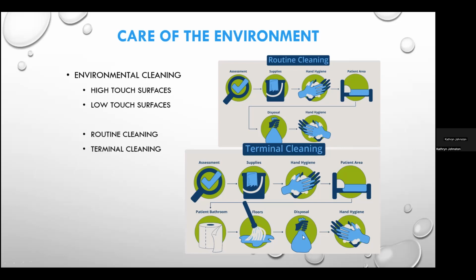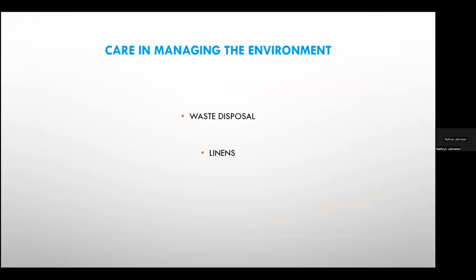And then as the person finishes their cleaning in that room, before they leave that work area, they should remove their gloves and perform hand hygiene. So those are the basic steps for care of the environment as far as standard precautions goes.